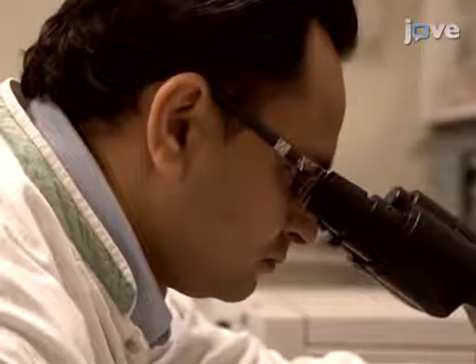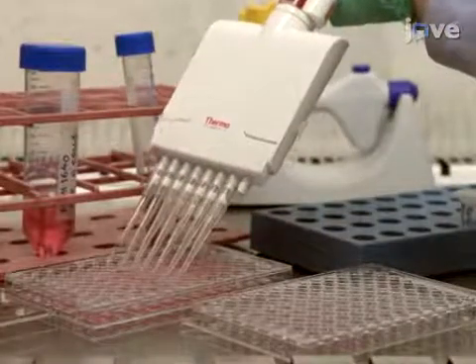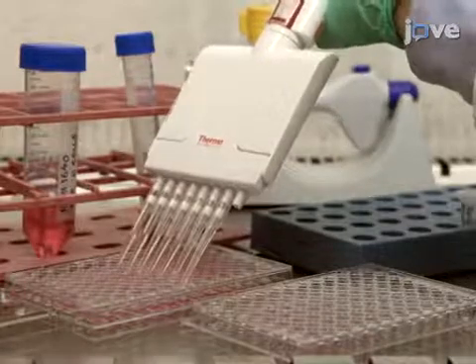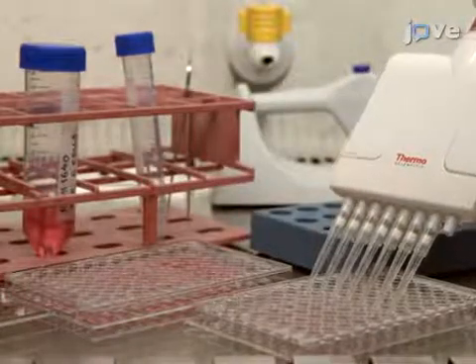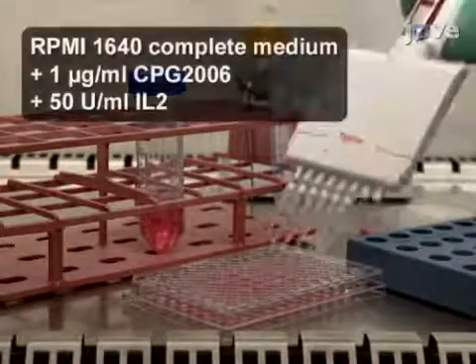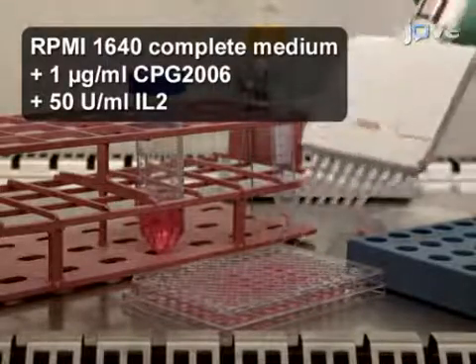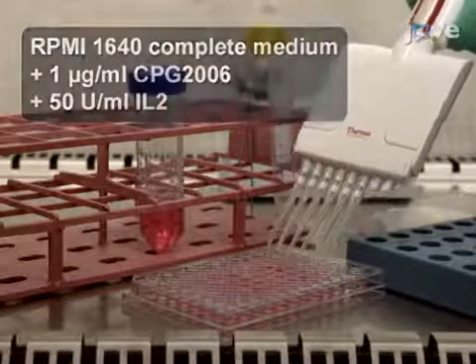After a week of incubation, inspect the cells under a microscope for B cell growth. After 2 weeks, change the media. Slowly aspirate 90 microliters of medium from each well and transfer it to a new plate to test for IgG production by ELISA. Then, add back 100 microliters of fresh supplemented medium, including IL-2, to each well. Continue monitoring for clone growth through their 3rd and 4th week of growth, repeating the media change each week. See the text protocol for clonal expansion methods.